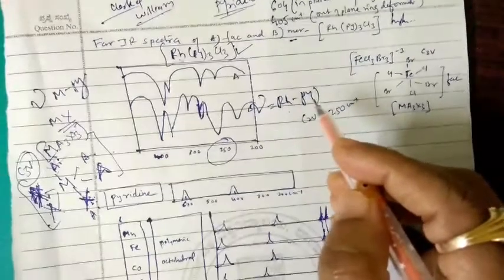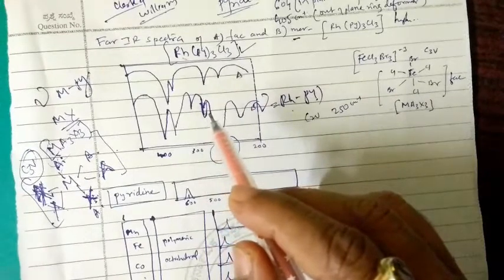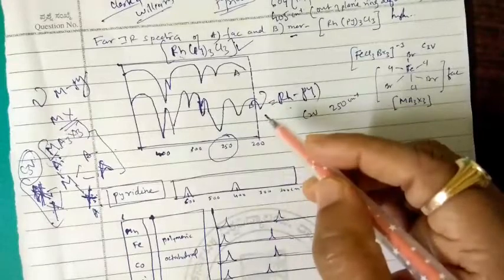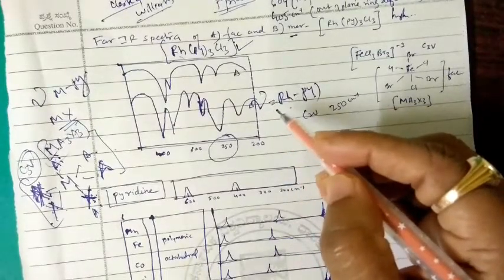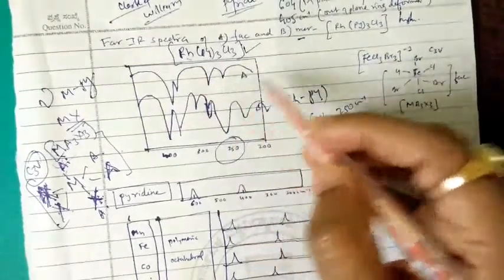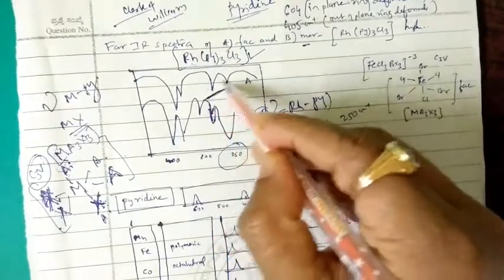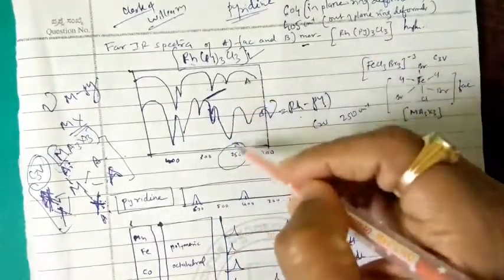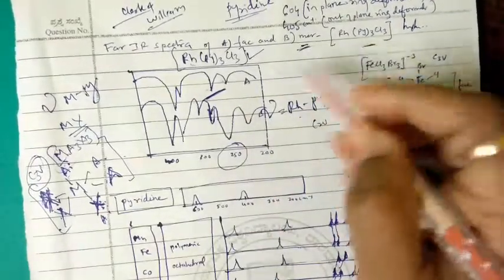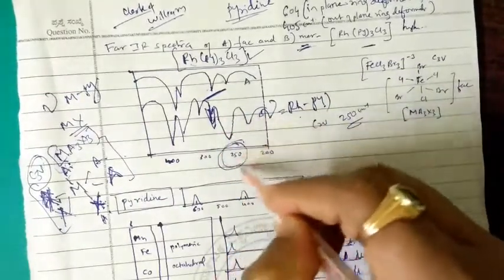The IR spectra of two complexes you can see here, and the vibration spectra of these in the low frequency are assigned. You can see the fac A1 is showing two vibrations here, two bands at 250 per centimeter, and the mer isomer is showing three, 1, 2 and 3, at these frequencies.